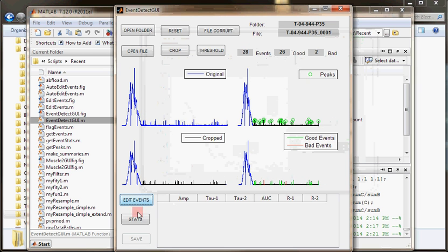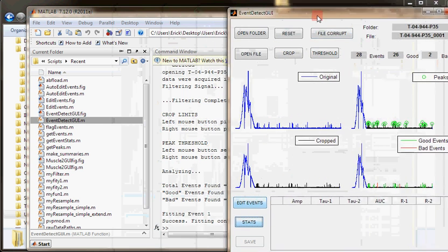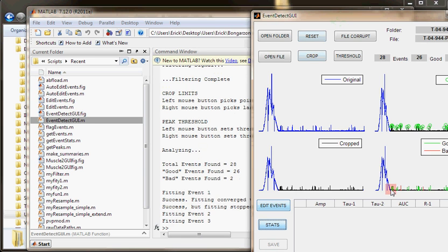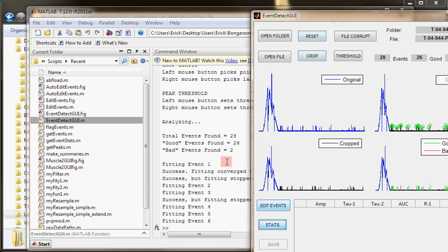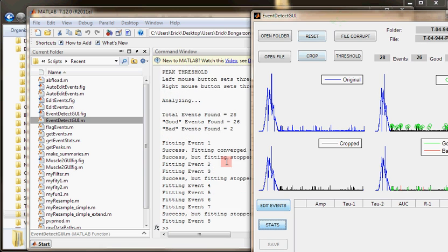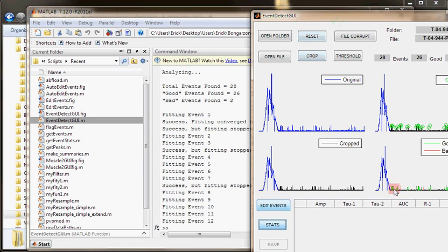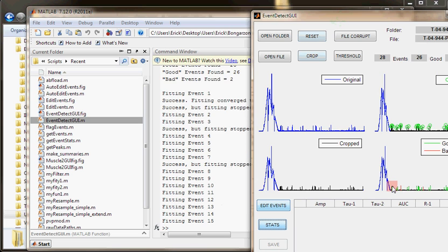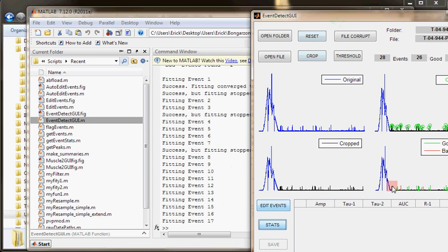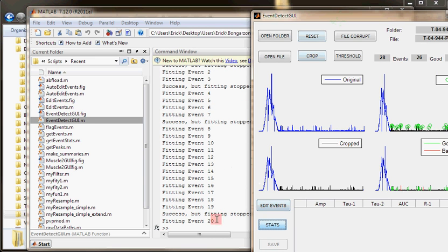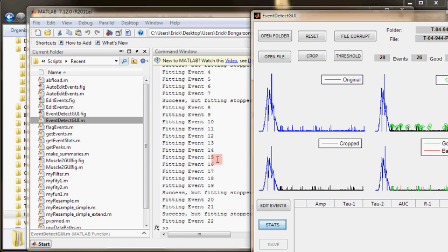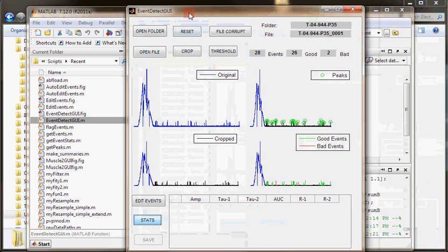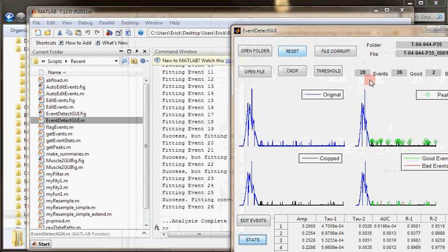The next thing I would want to do is generate the stats for each of those individual events that we have detected here. I will click stats. When I click stats, each event is going to be fitted with a rising exponential and a decaying exponential. As well as the amplitude and the area under curve, stats will be generated. But for the most part, the part that takes the most time is finding the mean square error for linear regression that will fit. There's 28 events.